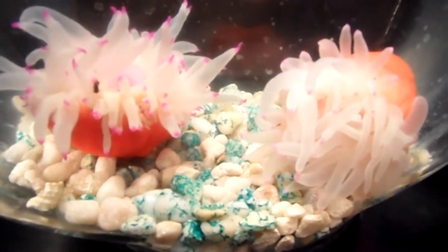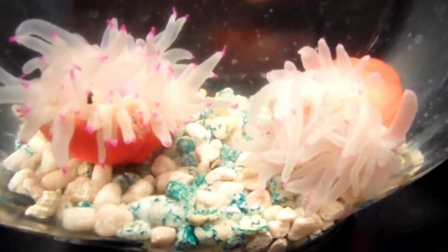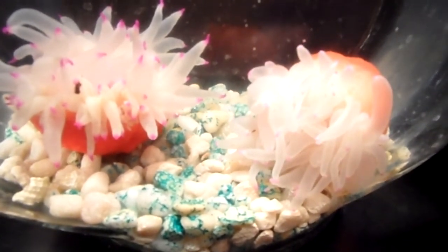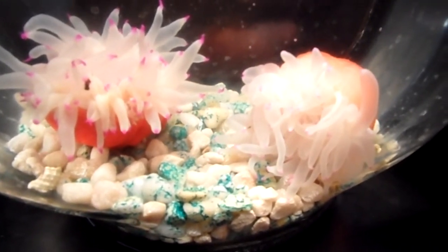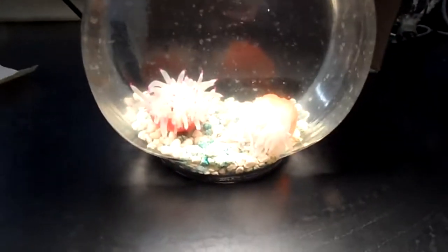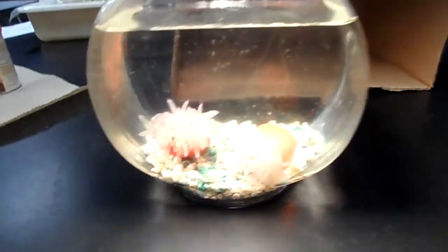Trying to see what's going on with the other one. Looks like we're pretty much done getting any kind of reaction. So that's the light test. Now I'm going to remove the spotlight or the lamp so that we can perform the rest of the lab.